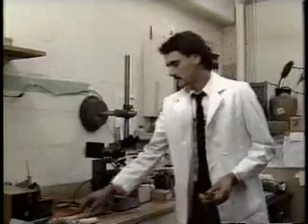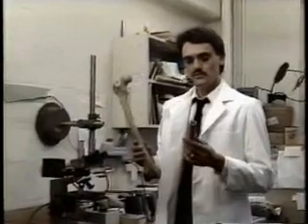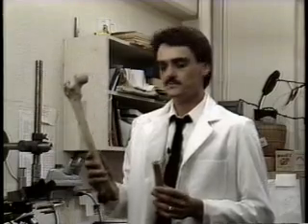As you can see, the first problem involved with this technique is that it is a destructive technique. You no longer have a complete bone once you have completed this technique. So it's something I always advise is to take all the measurements you can on the complete bone before you ever begin to cut.